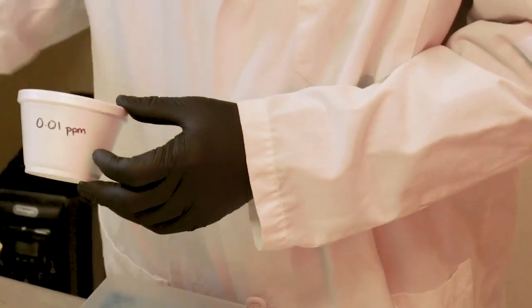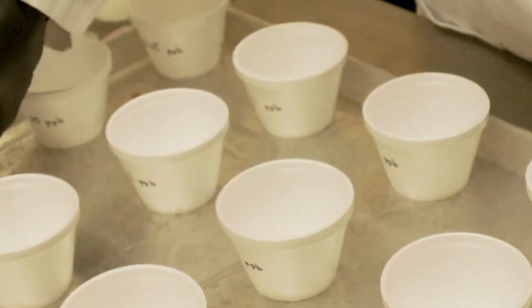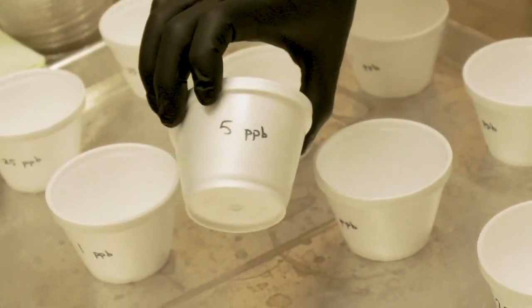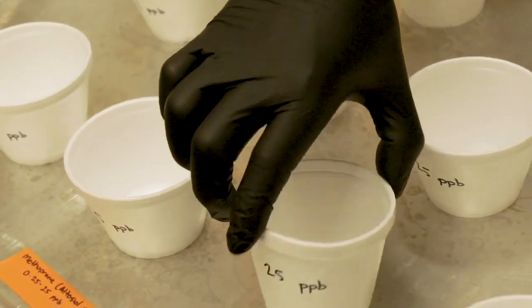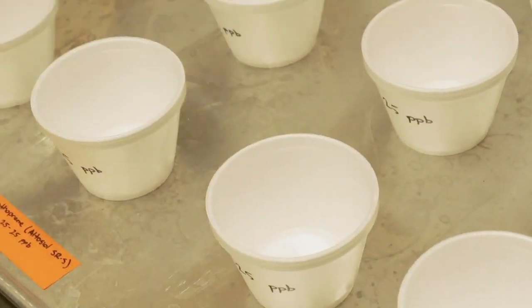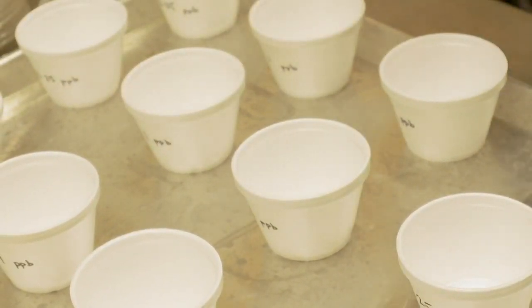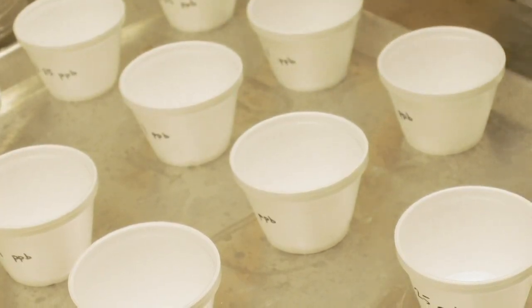Other supplies that you need to run a bioassay include plastic, wax-lined, or styrofoam cups containing 100 or 200 milliliters of water. When evaluating methoprene or other compounds that are hydrophobic, one needs to take precautions to avoid binding of the control agent to the bioassay cups. Silanized glass vessels are recommended. Styrene cups also are an alternative bioassay cup.